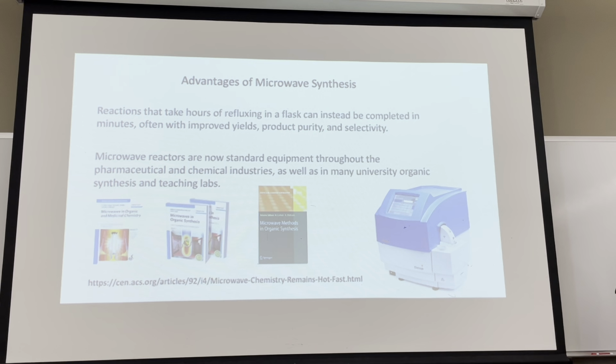So it does take some time up front to do the method development and optimization, because not one procedure is going to work for every reaction. So you do have to spend some time optimizing the conditions, and so some people don't really want to spend that time, and so they don't do it.